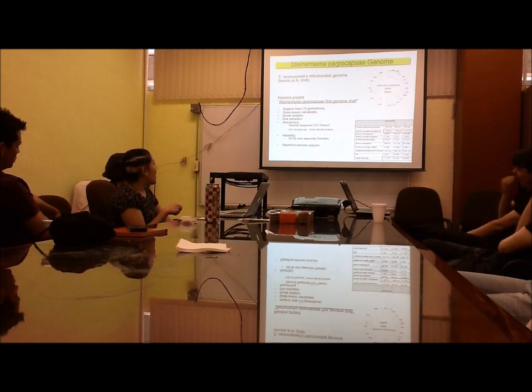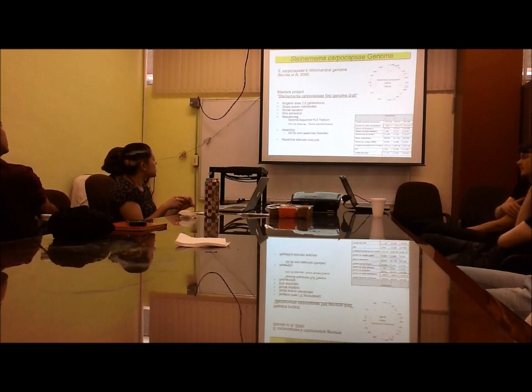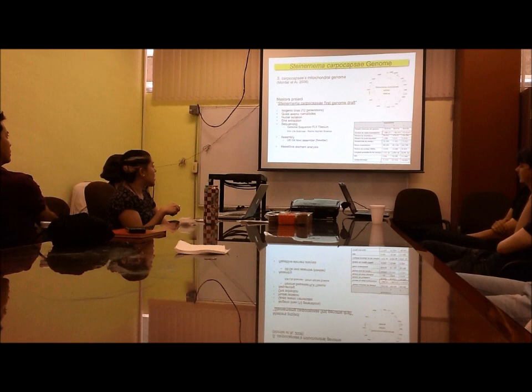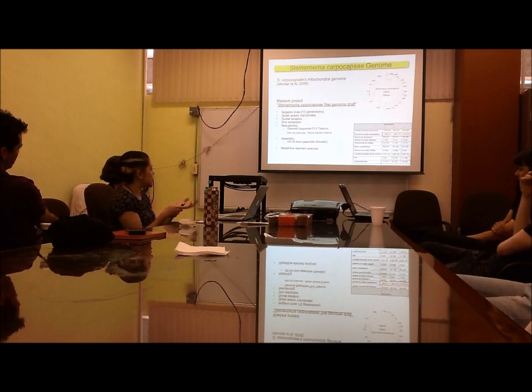made isogenic lines. I have 12 generations. That was in order to get a very homogeneous population. Then I had to get rid of the bacteria, so I got axenic nematodes. This was just to avoid getting the bacterial genome sequence. Then I had to isolate the nuclei because there was no point in getting the mitochondrial DNA. You already have the mitochondrial genome.